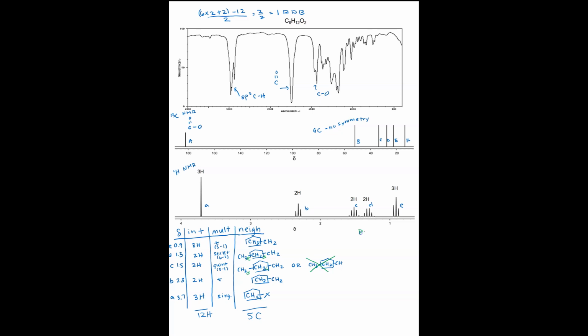So if I'm going to put my pieces together, I have a CH3, which was E, CH2D, CH2C, which is next to another one. It's probably next to B. So that's next to CH2B. So I have that 4-carbon chunk. So this one is B, and this is C. And then I have a CH3 next to something. The other piece I have is the ester.